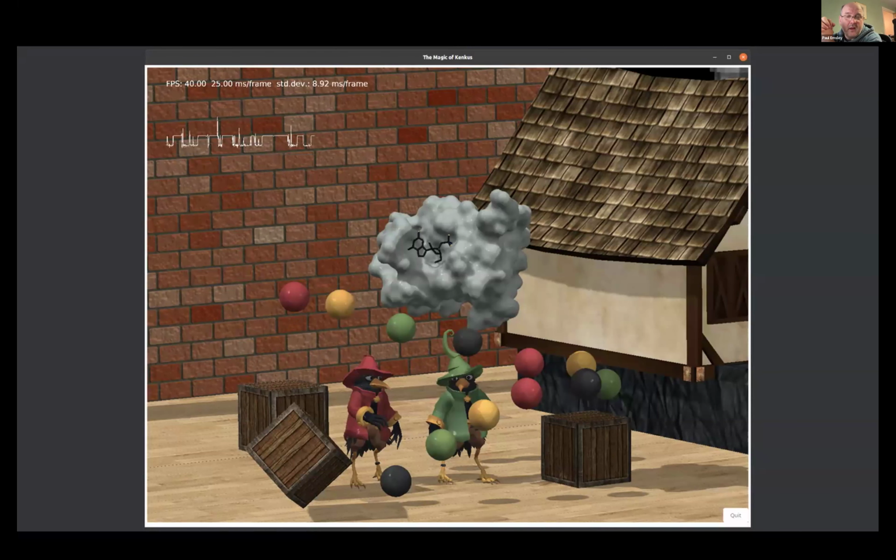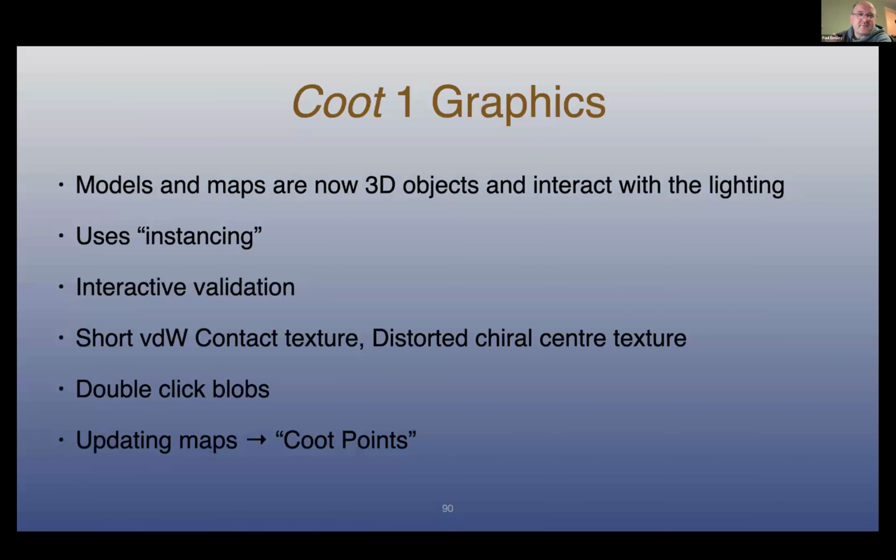This is a ChimeraX surface here, exported and then loaded into my engine, just to make sure that it did sensible things with proteins as well as D&D figures. Right.